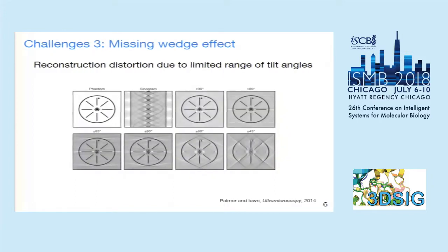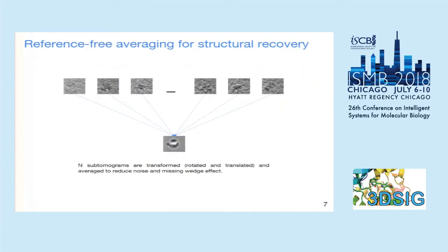The third challenge is the missing wedge effect. Since the sample cannot be rotated a full 180 degrees, the reconstructed tomogram will have distortions due to the missing wedge effect. This picture shows the missing wedge effect at different tilt angles — the more complete the tilt angle range, the lesser the distortion. Usually the tilt angle range is from minus 60 to plus 60 degrees, and compared to the true structure there is already strong distortion on the horizontal features.